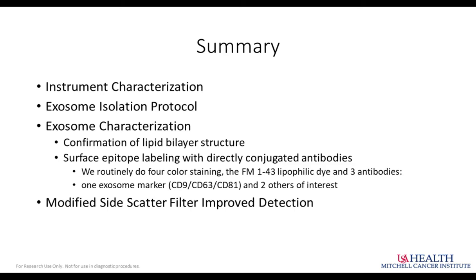Cytometry is going to have a much bigger part to play in this field, especially if we can move towards generating cell sorters that are more sensitive. It has been done. That's even harder. Oh my gosh, I can't even imagine. But if we can then push to that point, so we can now do this surface labeling and then sort out a specific marker on the surface and see what's inside of maybe those exosomes. Sky's the limit. It's a very exciting field. Excited to be a part of it.